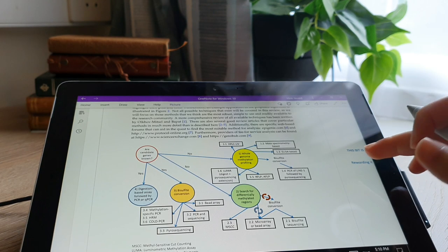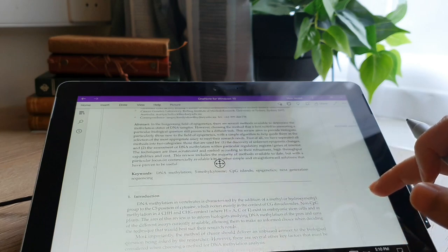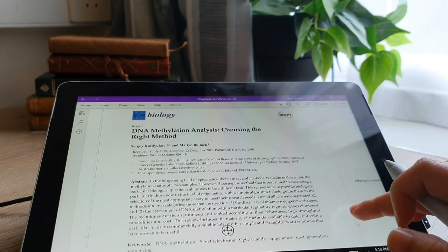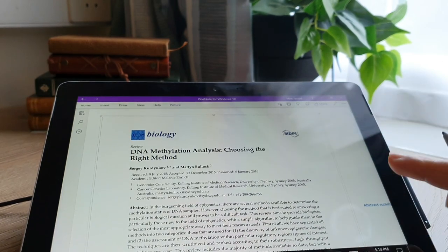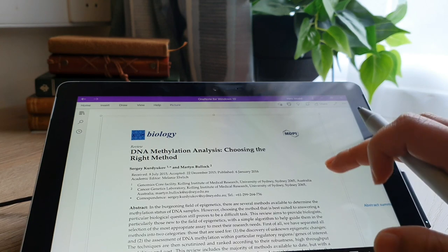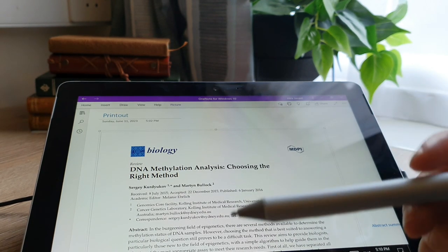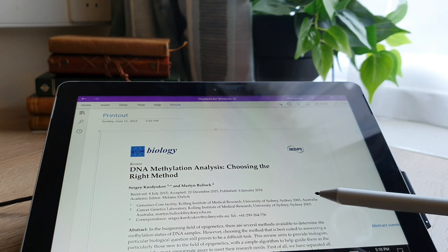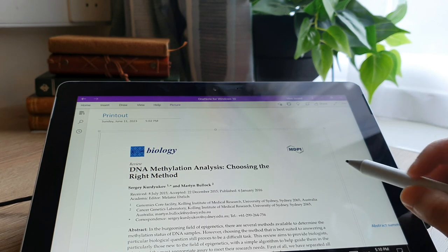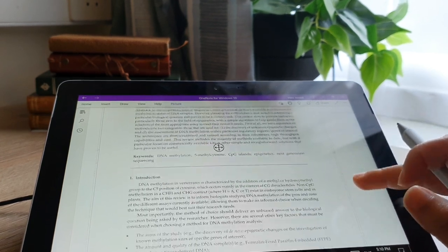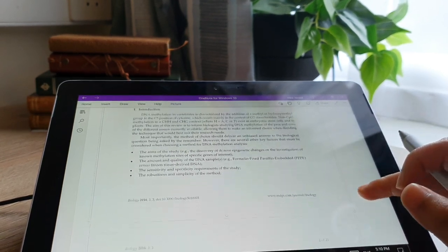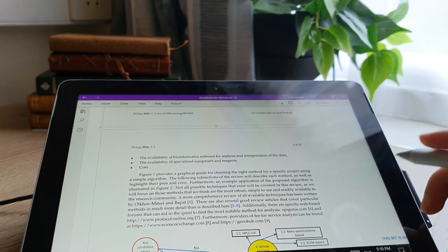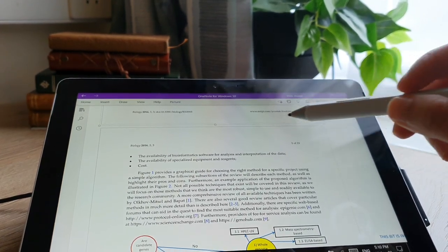Okay, so if you're serious about going paperless, and making your life easy at the same time, I highly recommend getting a tablet. So the OneNote experience on a tablet is just phenomenal. And I do prefer Microsoft tablets over Apple ones, just because you get a whole computer, and Apple sucks. Anyway, there, I said it.